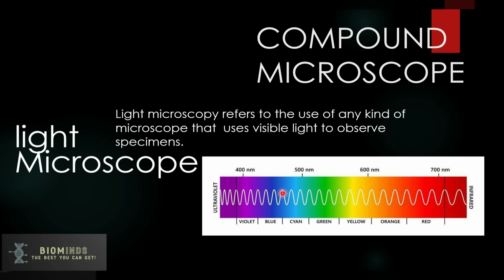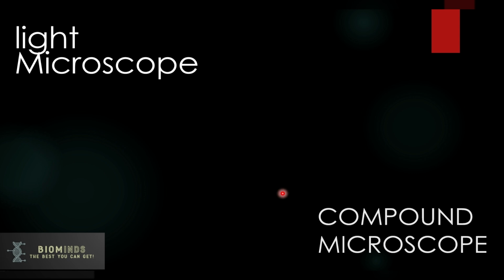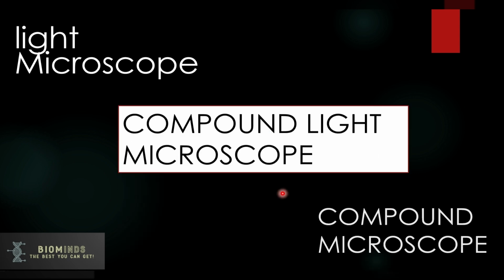In many labs we use sunlight as the visible light source to observe the specimen. So the compound light microscope is the microscope where we use visible light as a light source.